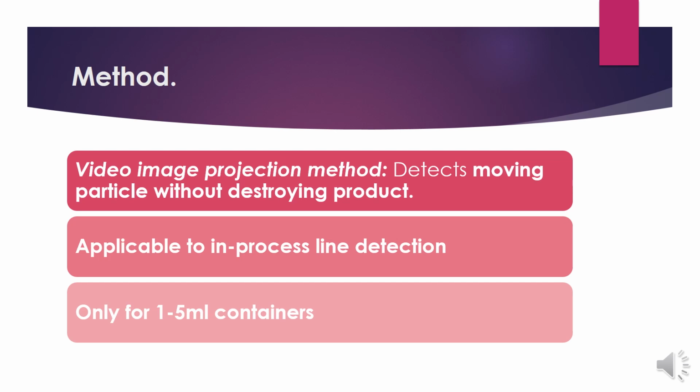But there's a limitation that it's only applicable for containers having a volume of up to 5 ml. Means only 1 to 5 ml containers can be tested by this method.